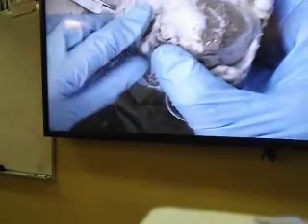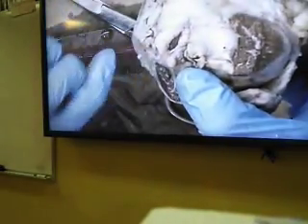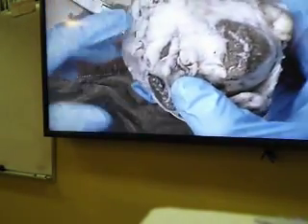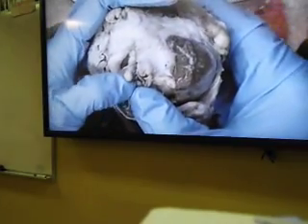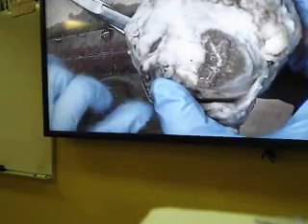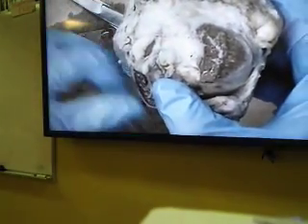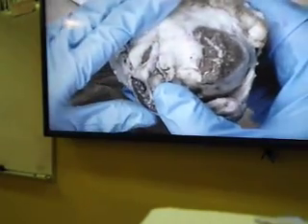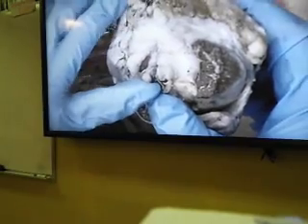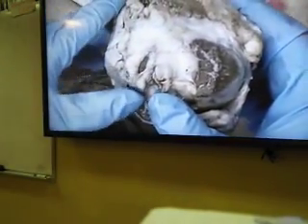So the optic nerve comes from the back of the eye, from the region or structure which we call the blind spot or optic disc, where there are no photoreceptor rod and cone cells, and the optic nerve takes the visual information, that's the spatial sense of vision, to the thalamus of the brain, and the thalamus sends that spatial sense of vision into the occipital lobe of the cerebrum for interpretation.